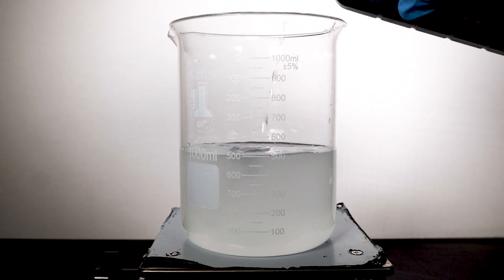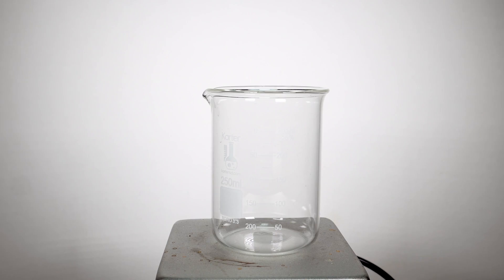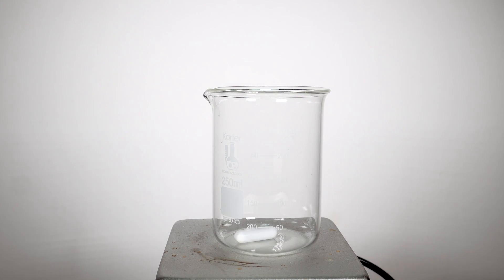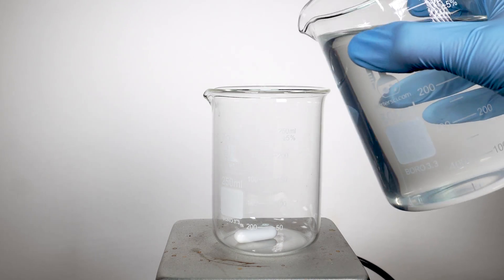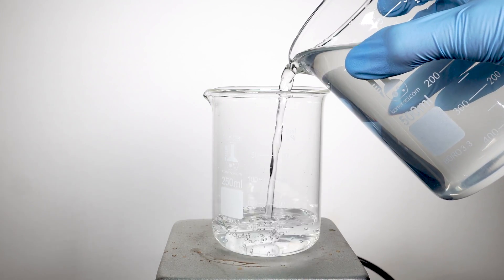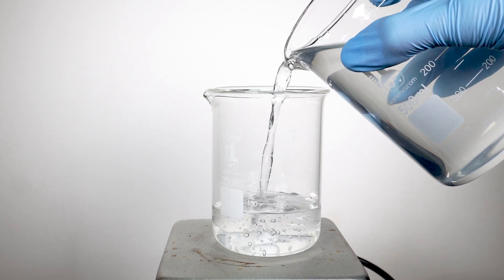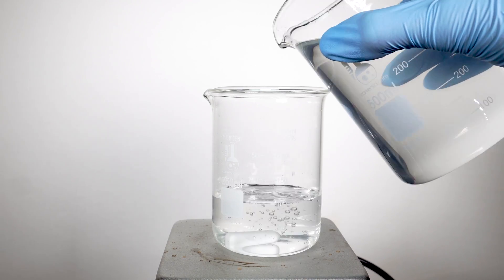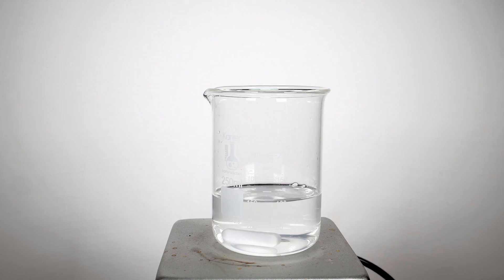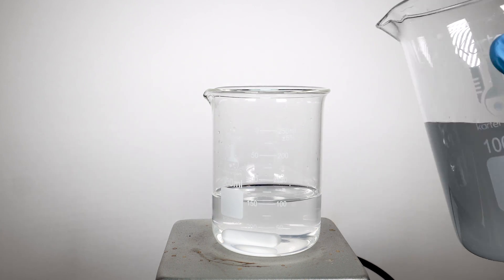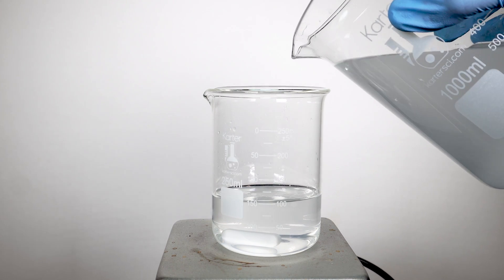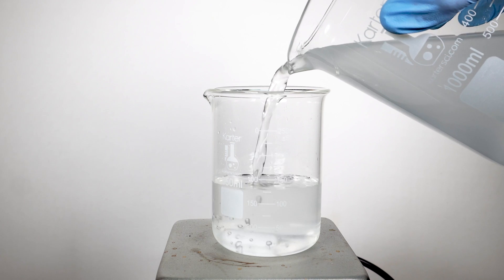For the clock reaction to work best, we have to add in equal parts of solution A and solution B into a beaker and mix them together. The time for the solution to change can be determined by measuring the reaction rate. For this specific composition of compounds, it takes anywhere from 45 seconds to 50 seconds to change color. While we wait, let's talk a little bit about what's going on here.